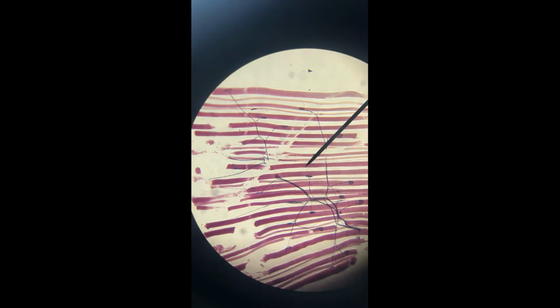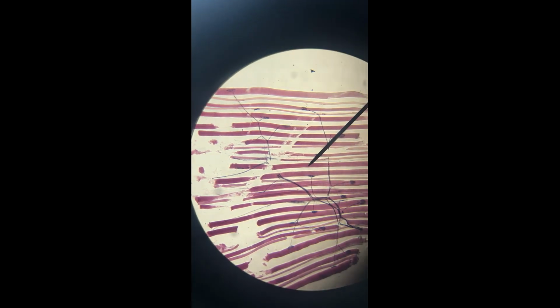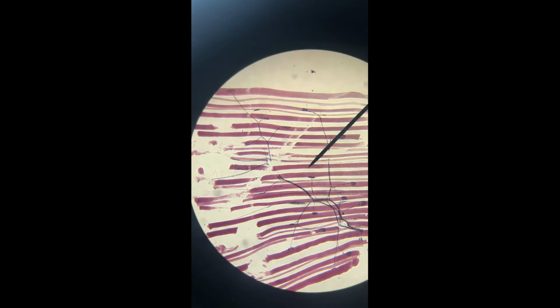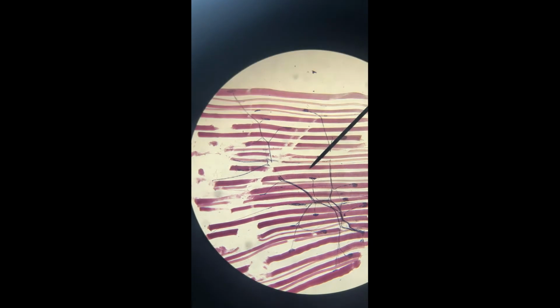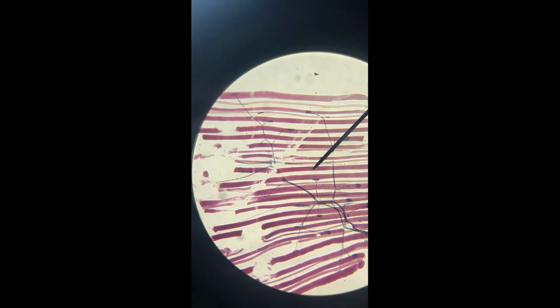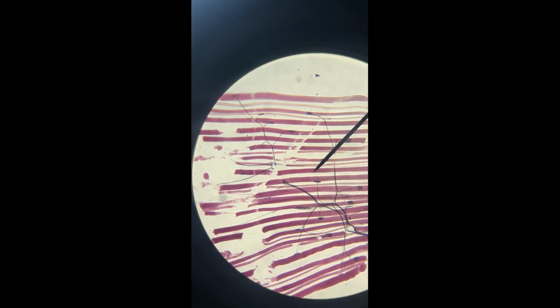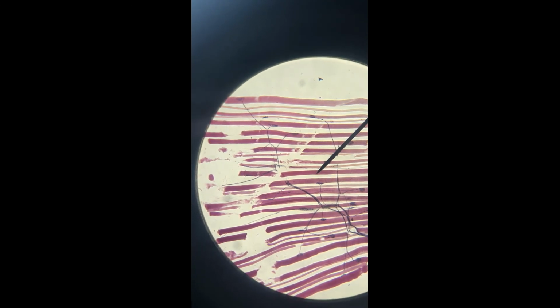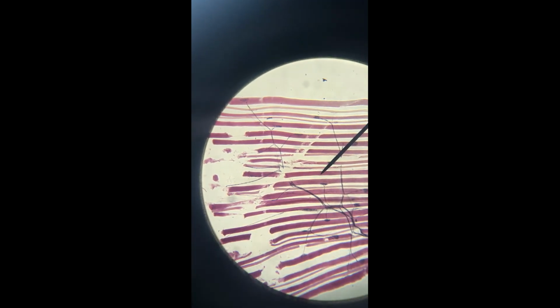So yeah, what's the pointer on? One cell, it's a muscle fiber, so that's actually technically on its plasma membrane. Do we see a nucleus of a skeletal muscle cell here? I don't think so. Those enlarged regions that you see on the neuron are called synaptic knobs. They're holding neurotransmitter. You get to learn about all of that later.